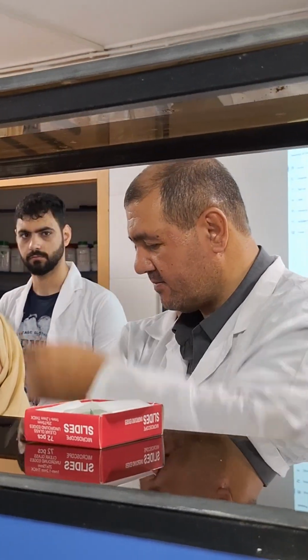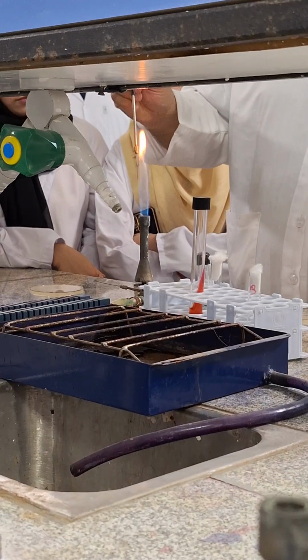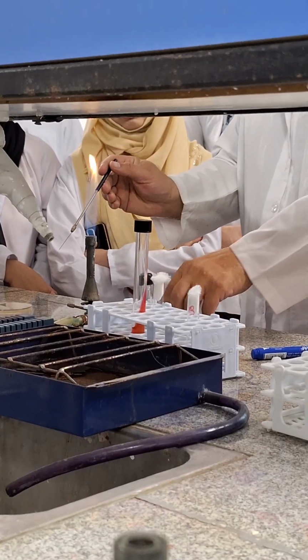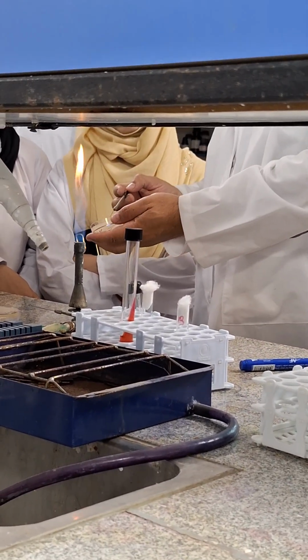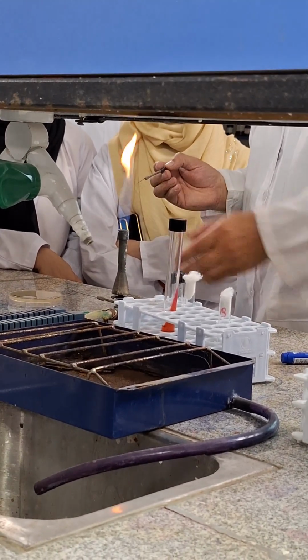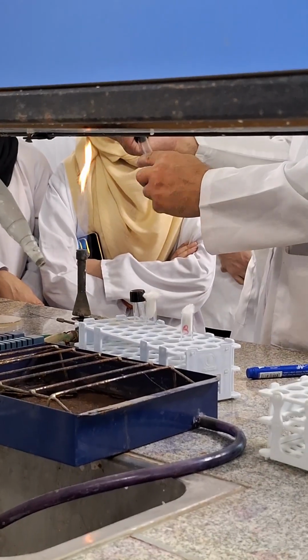Insert your needle. Touch your needle to the surface of bacterial colonies. Take a very small amount of bacteria and pay attention. Near the flame, open your tube.